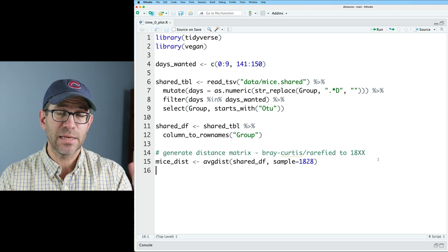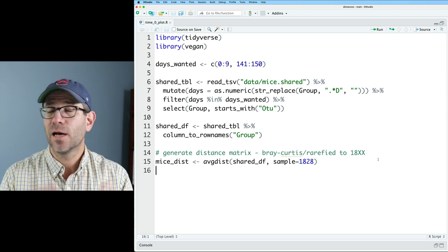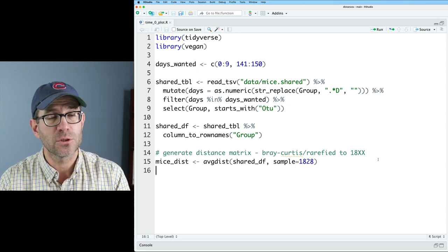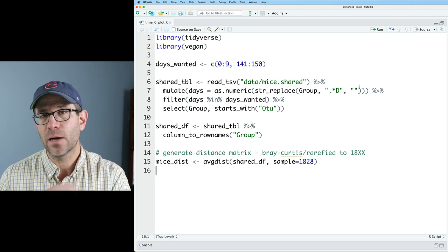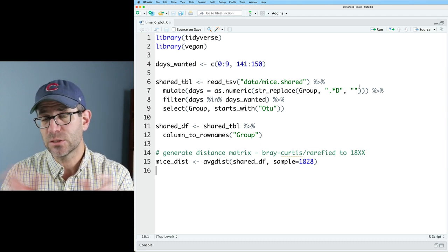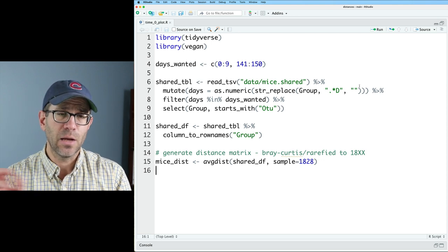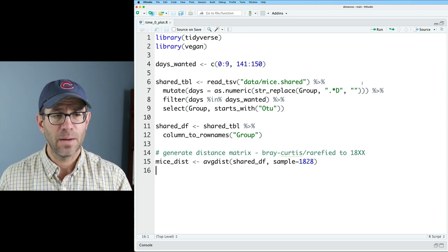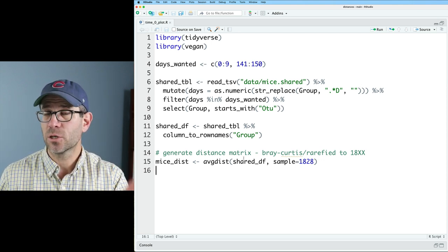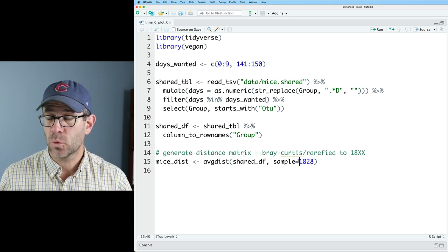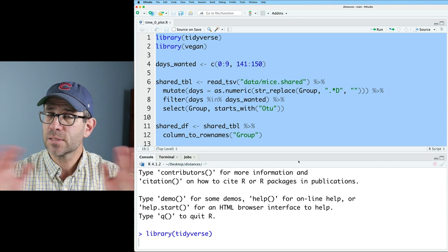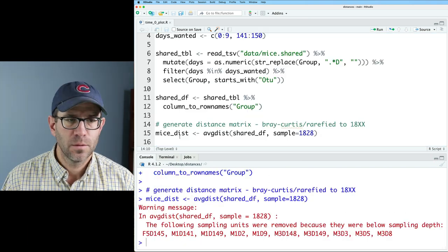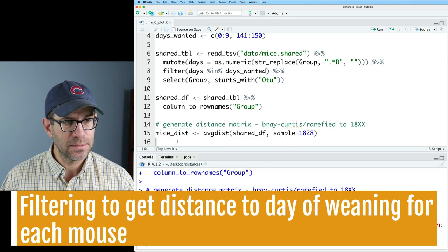So this script reads in an OTU count table, it's called a shared file generated by the mothur software package. What we're doing is we're filtering out the days that aren't between these two intervals, days zero through nine and 141 to 150. And then we generate a Bray-Curtis distance matrix, it's rarefied to 1828 sequences per sample. I'll go ahead and run all this, so we can get going generating our figure. Very good, so now we have mice dist, which I will use to start a whole new pipeline.